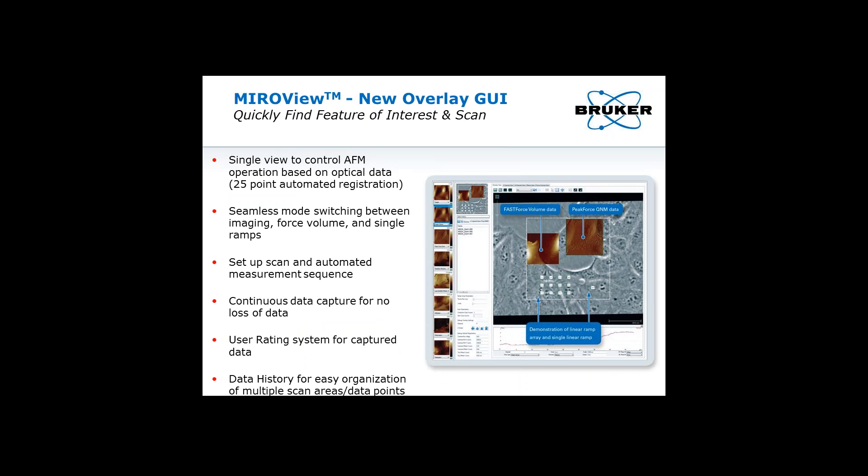The Bioscope Resolve features a brand new software interface, Nanoscope version 9.2. For those familiar with Bruker's Bioscope AFMs, MIRO — Microscopy Image Registration and Overlay software — registers the AFM scan area to the optical field of view and uses optical images to guide the AFM to regions of interest. On the Bioscope Resolve, MIRO is fully integrated into the software as a single MIROView, allowing users to control and view AFM measurements being executed in real time, directly correlated to optical images. MIROView has a fully automated 25-point registration procedure for each microscope objective saved directly in the software.